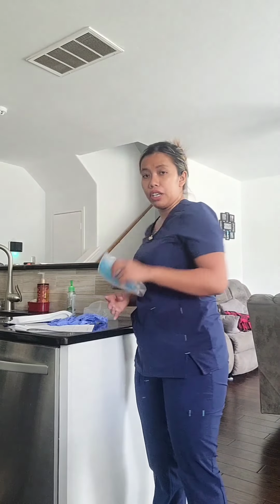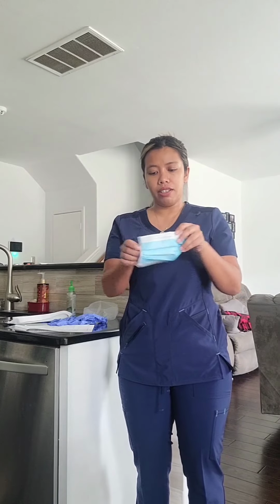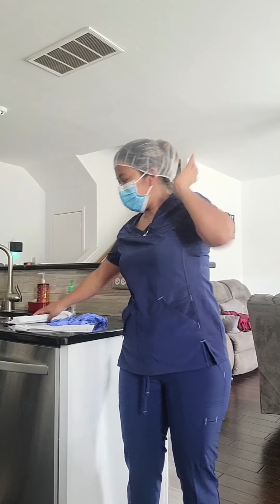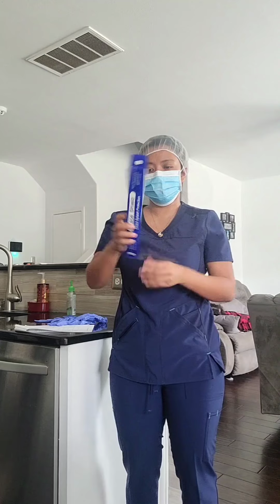Next, I'm going to put the face mask on. And now the hair cover. And now I'm going to put the face shield on.